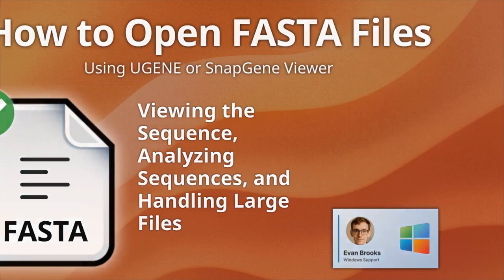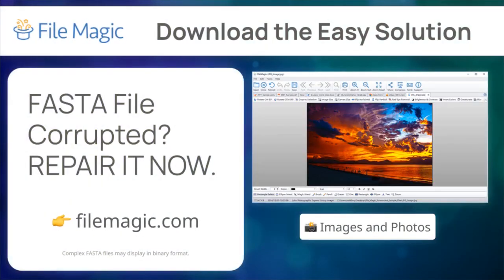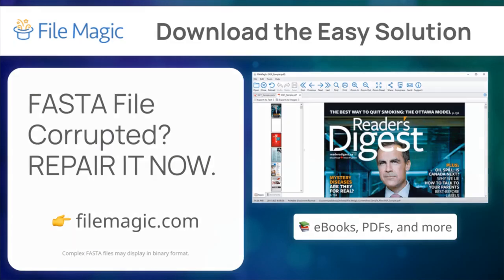Let's sequence it. Consider this your first line of defense. A universal viewer bypasses many common FASTA Windows errors. This is my personal favorite utility for this task, and I will be discussing it soon.